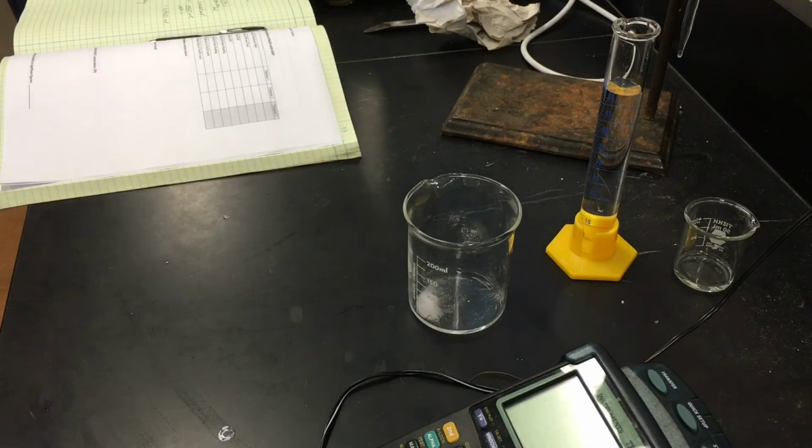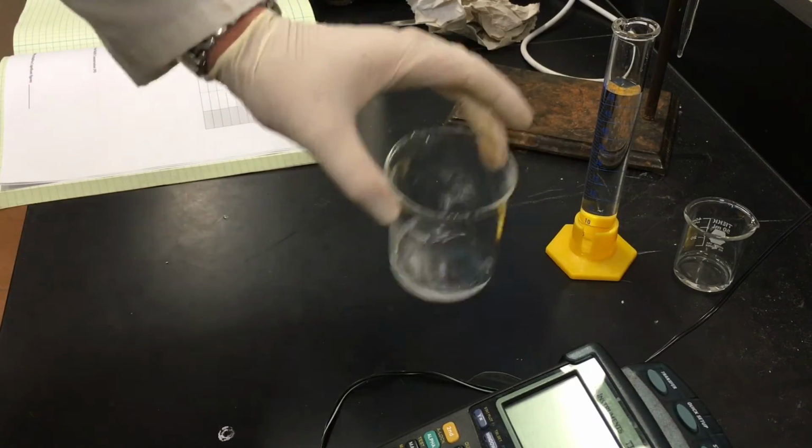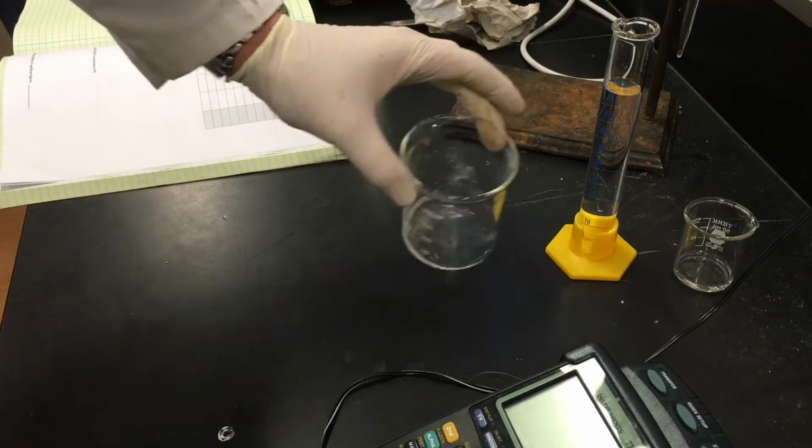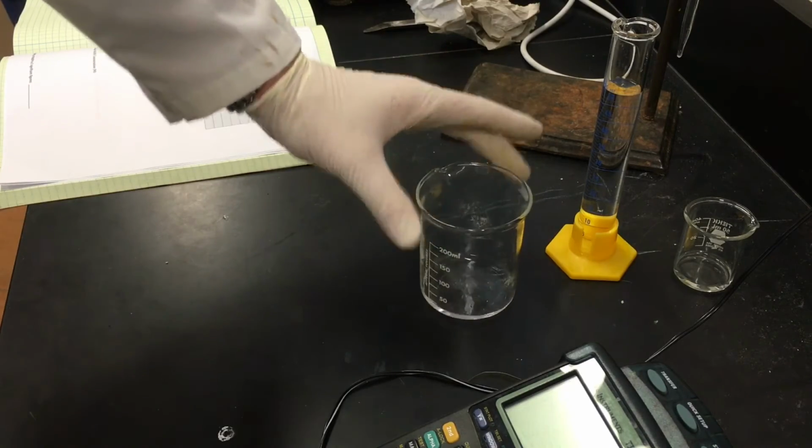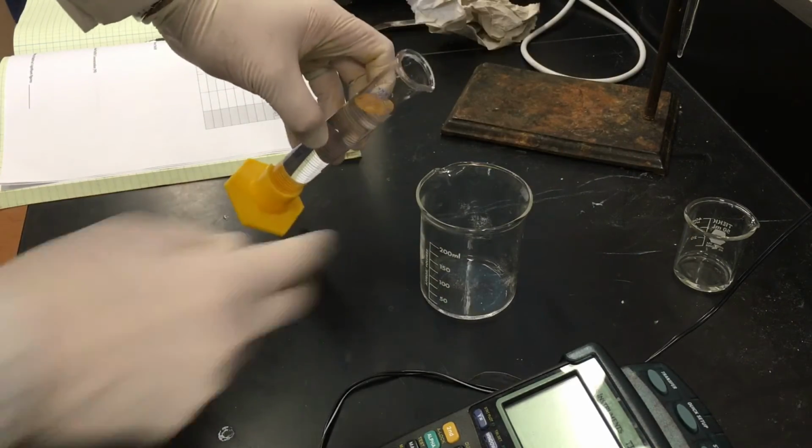So we have 10 milliliters of 95% ethanol. Dissolves very, very quickly. We're going to add 50 milliliters or so of water.